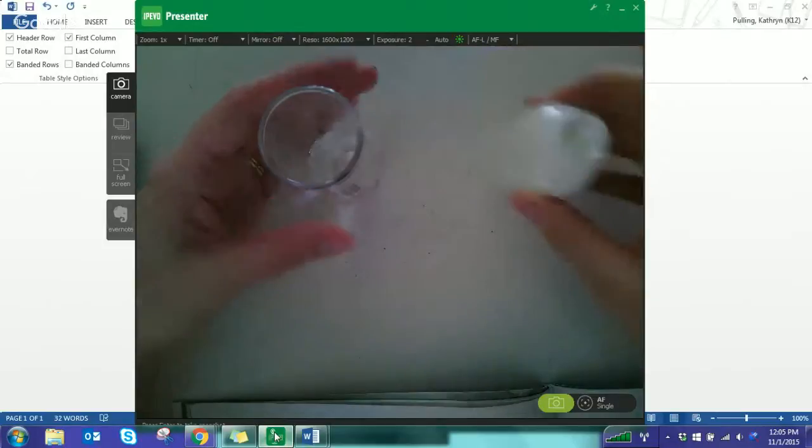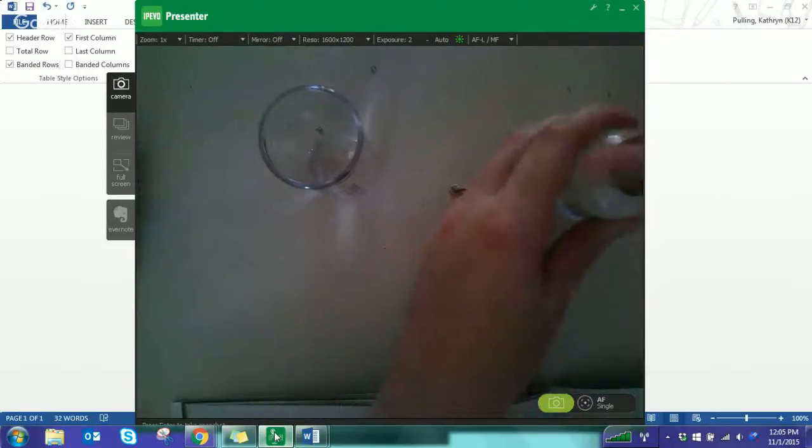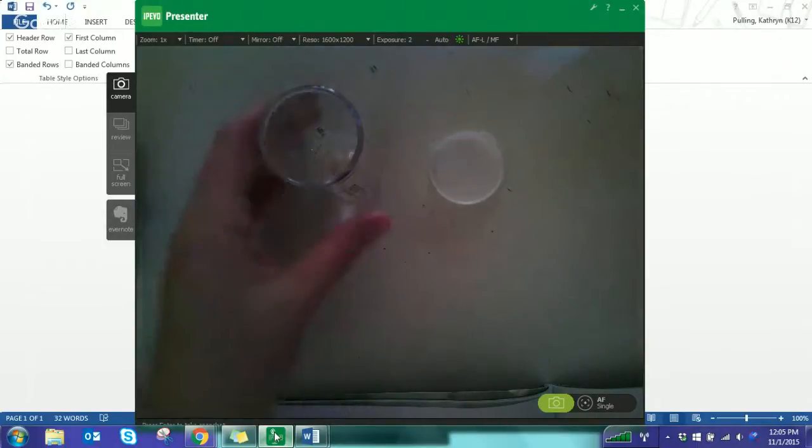Okay, when measuring this, you do want it flat on the ground, right, so that you can tell that you actually get there correctly. So there's my 25 milliliters. I'm going to keep my cap handy. I don't necessarily need it, but it's always a good idea if you're shaking things to maybe put the cap back on. Then it says add 3 drops of the phenolphthalein indicator.